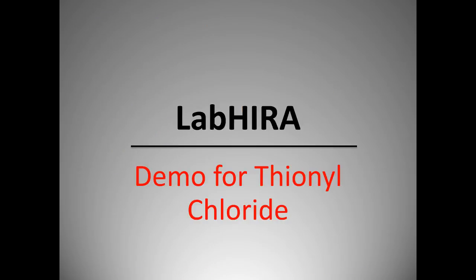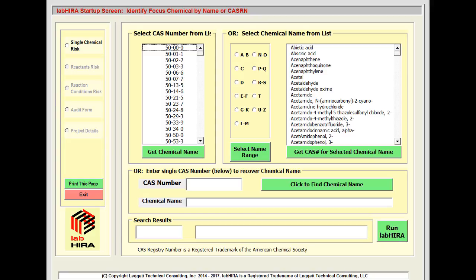Now let's do the same thing, but this time for a much more reactive chemical, thionyl chloride. So this is the second demonstration using labHIRA. For the purpose of the demonstration, I'm going to type in the CAS number 7719-09-7. Click to find the chemical name. There we are, thionyl chloride.